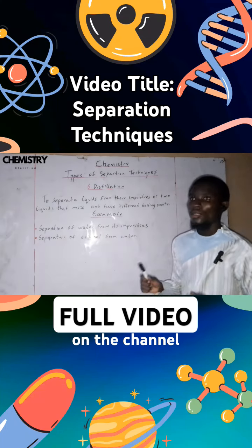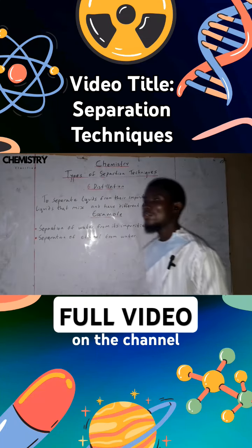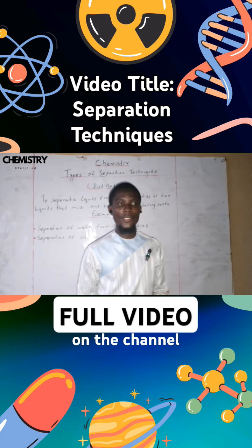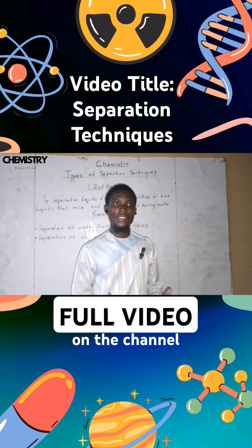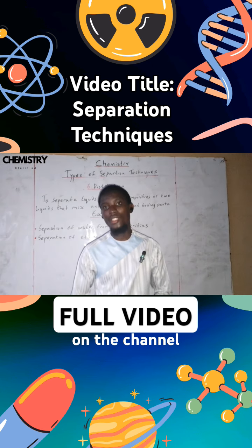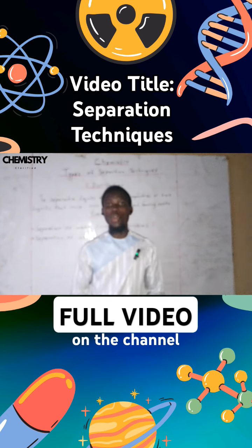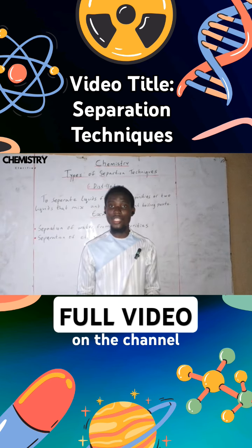Distillation. This distillation can be used to separate liquids from their impurities. Let me simply explain this. When you have water, it is always not pure because there are some dissolved minerals in it. So now, the kind of water that we use for experiments in the laboratory is called distilled water. And how is this distilled water made?